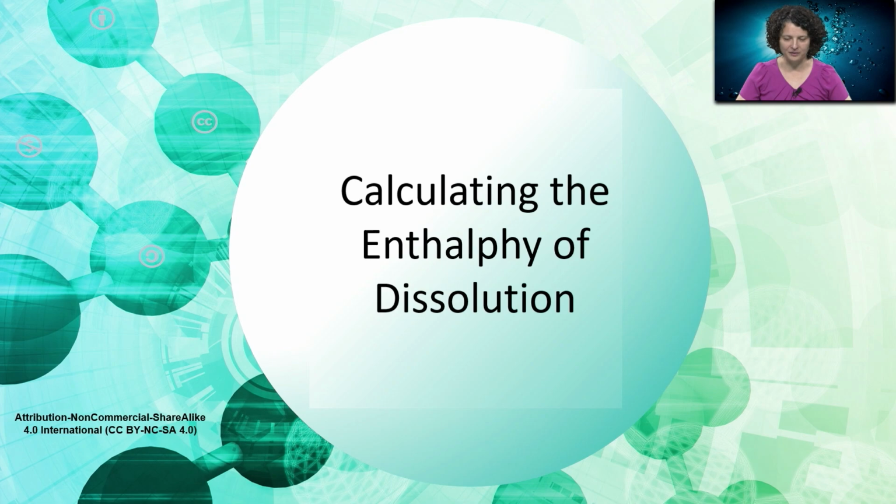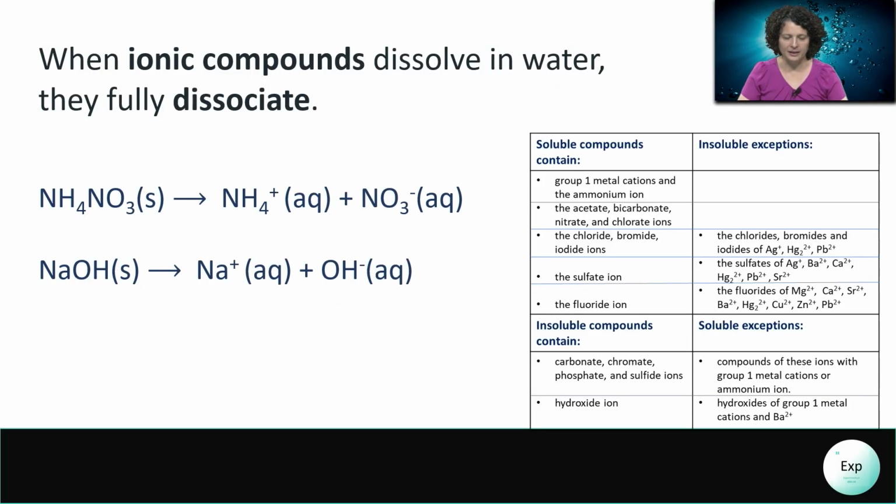Calculating the enthalpy of dissolution. When ionic compounds dissolve in water, whatever dissolves will fully dissociate. And that is the example that we're going to observe today as we dissolve sodium hydroxide and ammonium nitrate in water inside a coffee cup calorimeter.